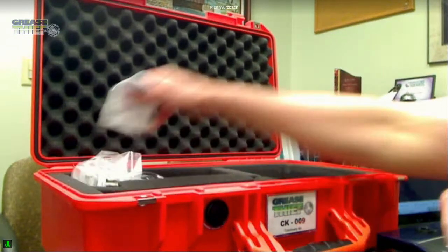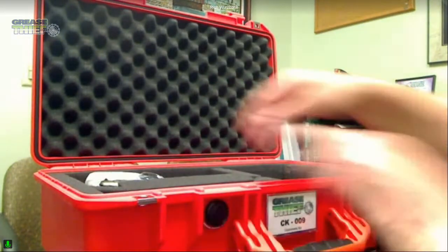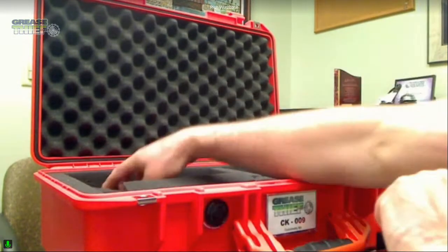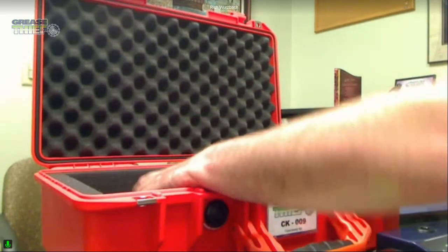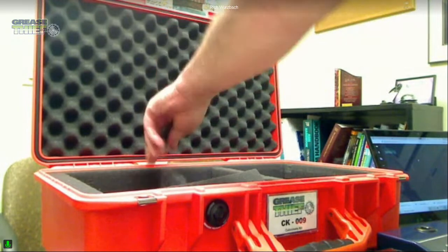Also in here, we've got the colorimetry capability. So you've got your charger there for your iPad, and then the key tool here is the colorimeter. So I'll close this back up.